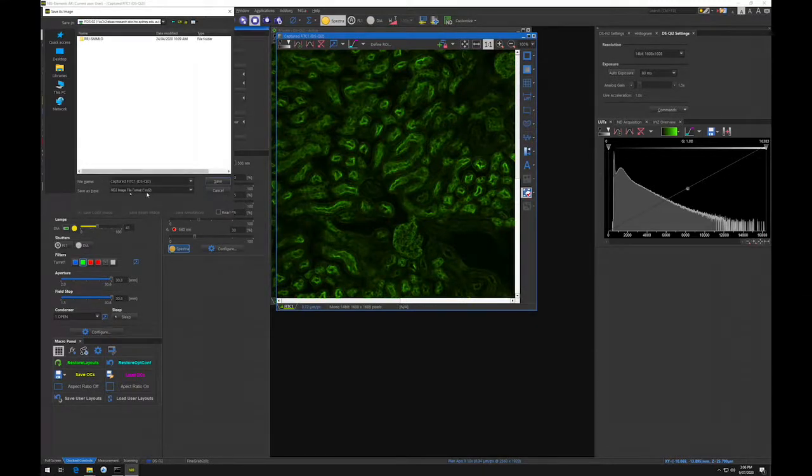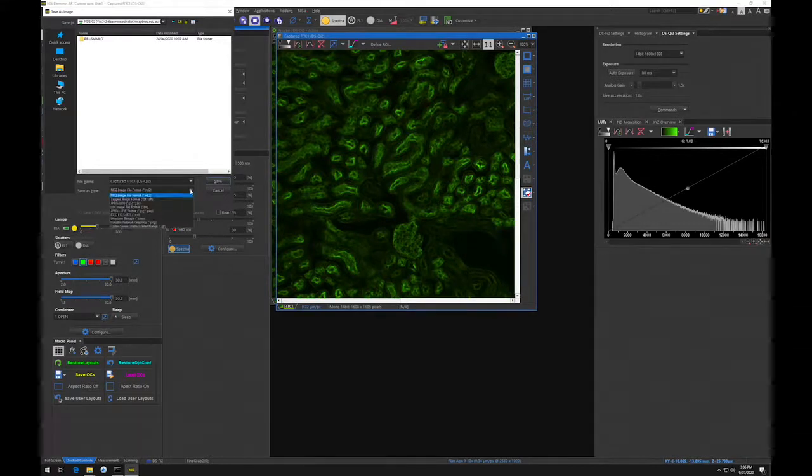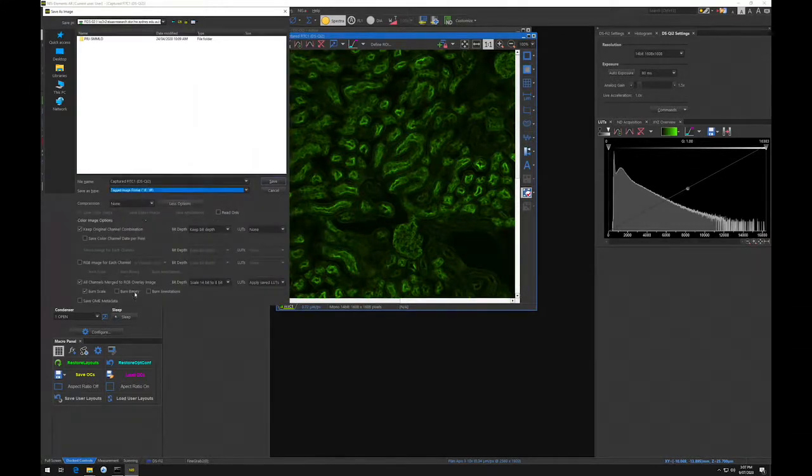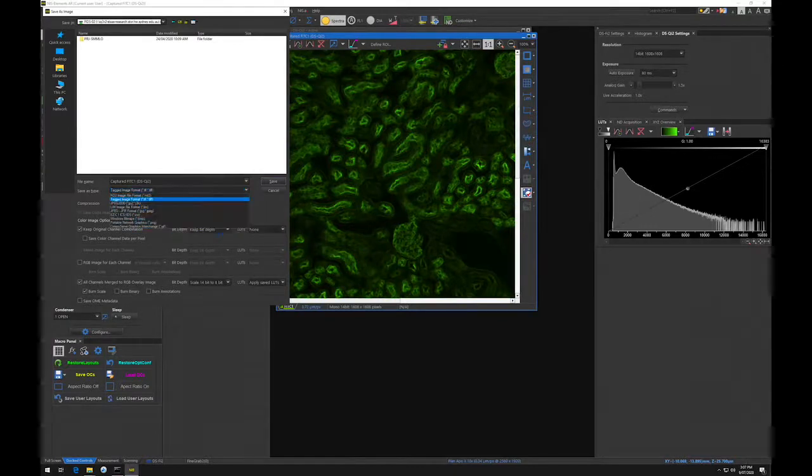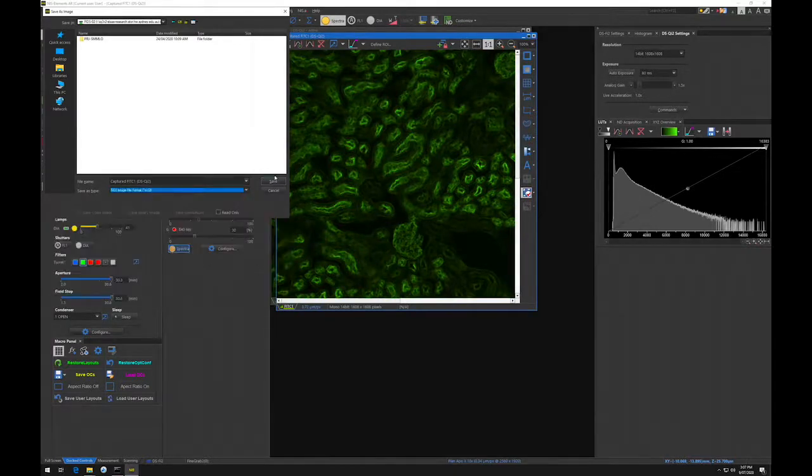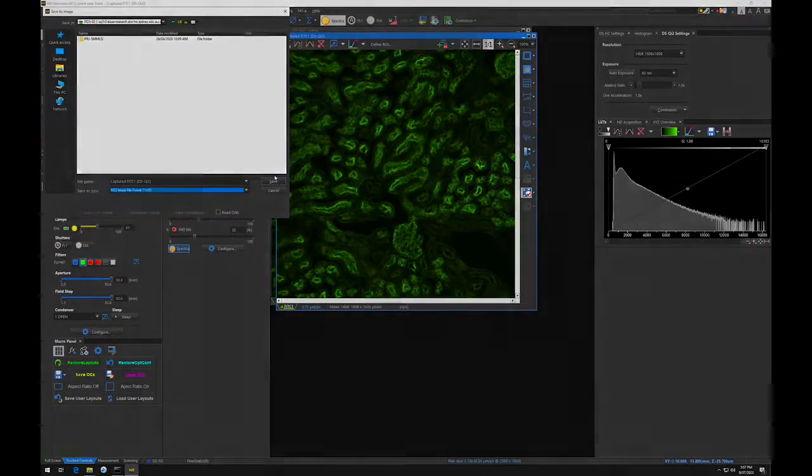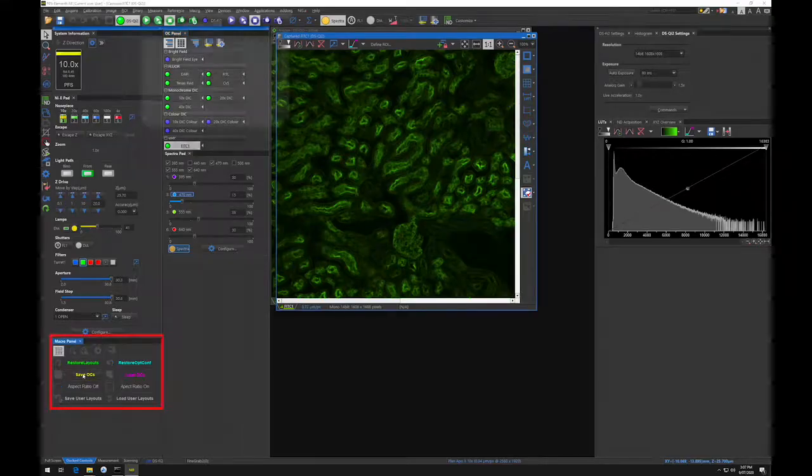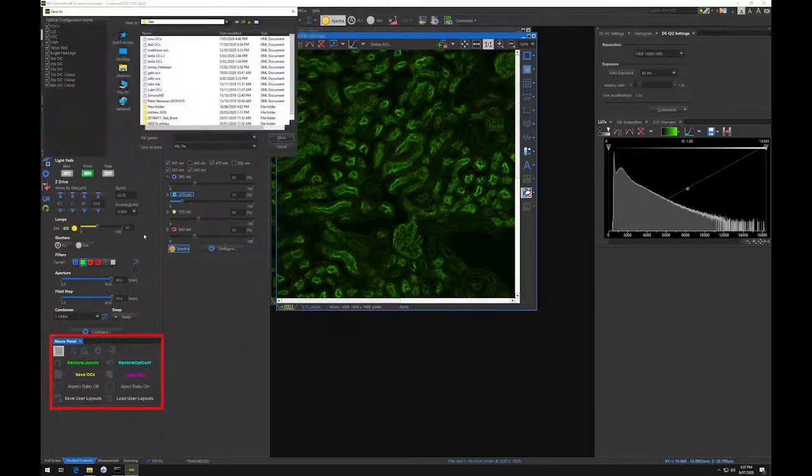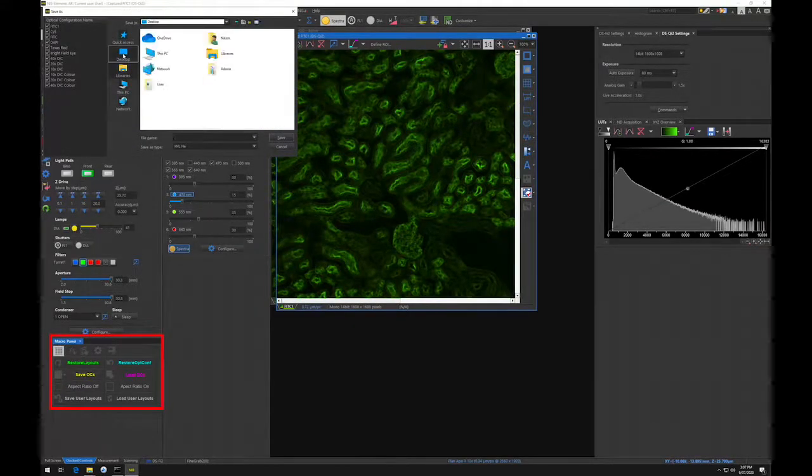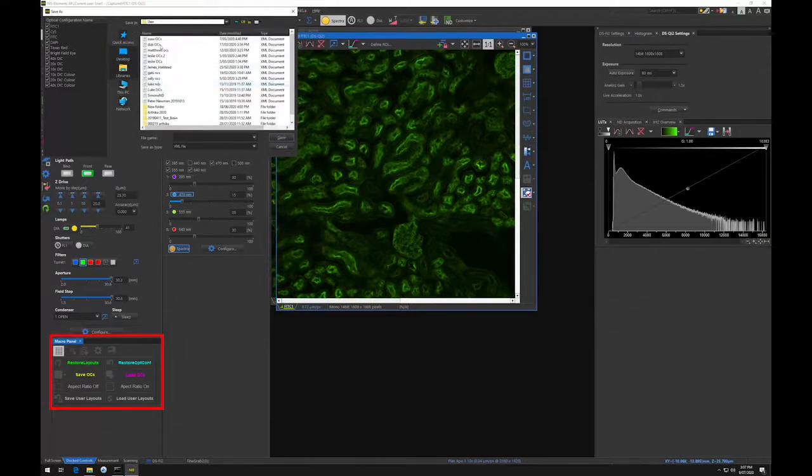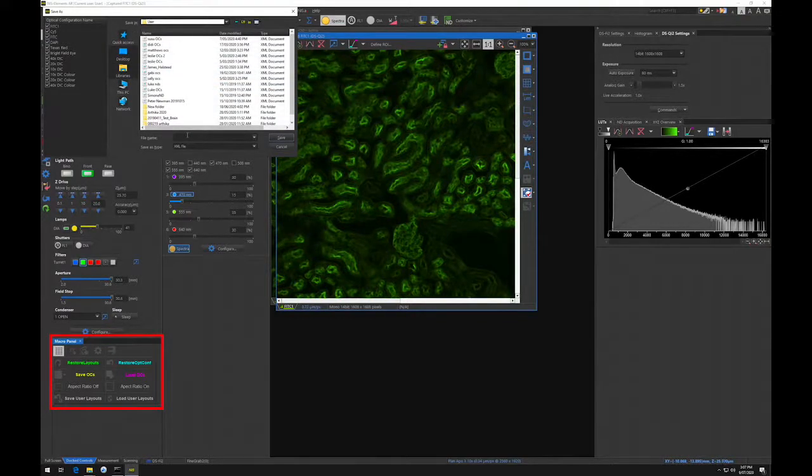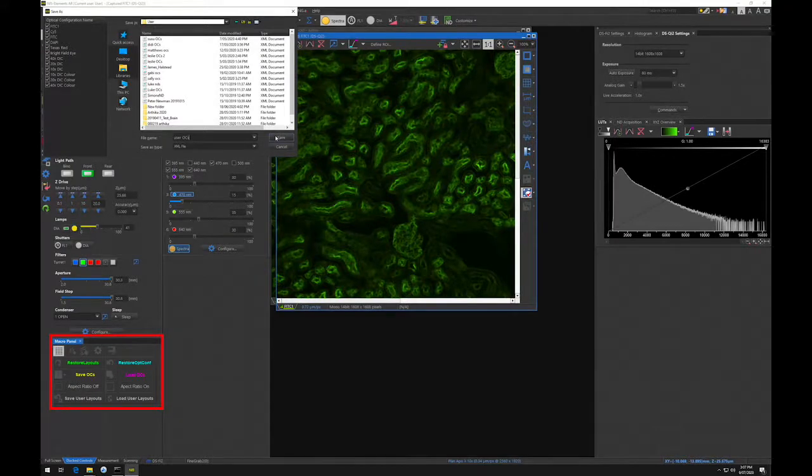You can also convert your image to an 8-bit TIFF and save that. But remember, when you do this, you are throwing data away. Be sure to save your OCs using the save OCs macro button. Please save them in the user folder on the desktop, and use the load OCs macro button to reload them the next time you use the microscope.